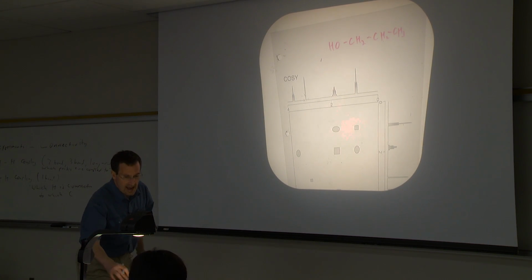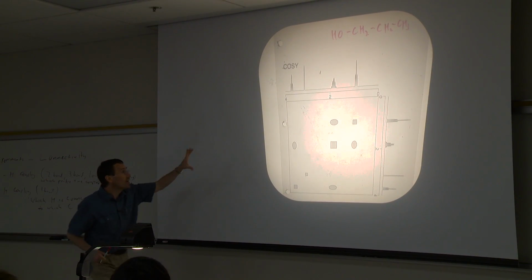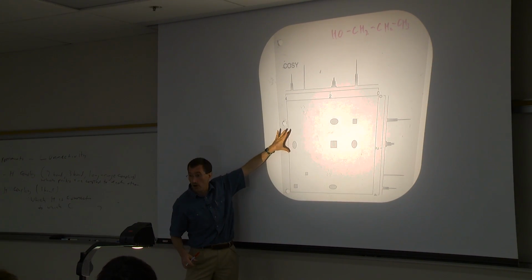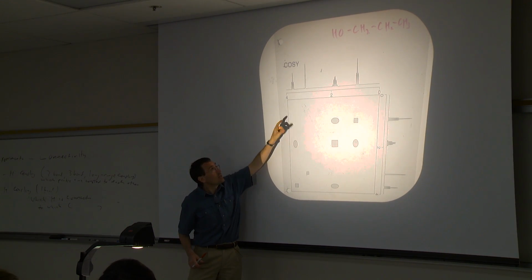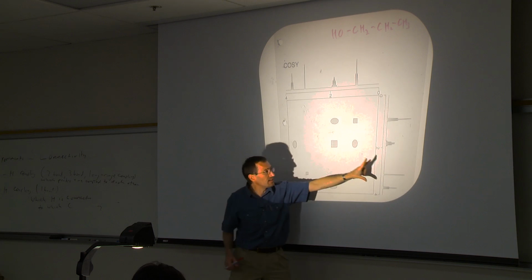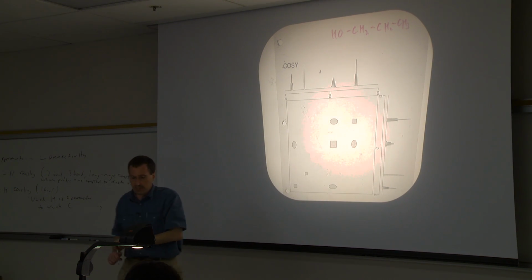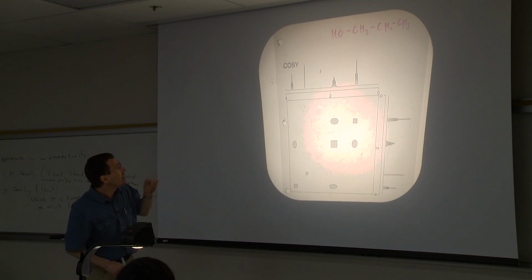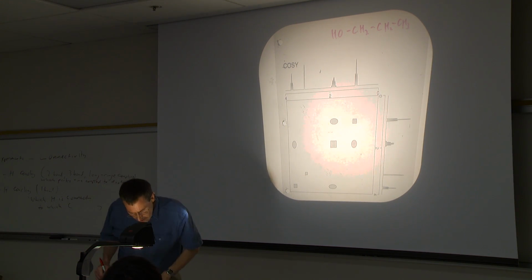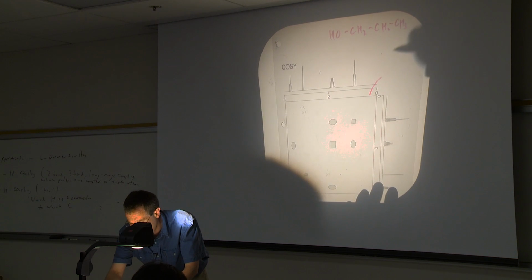And the actual 2D spectrum, again in this cartoon, is this square over here. What I've shown along here on the top are my, again, cartoons of the 1D spectra, which one often puts on the axes to help look at it. Remember I said 2D NMR has actually 2 frequency domains.